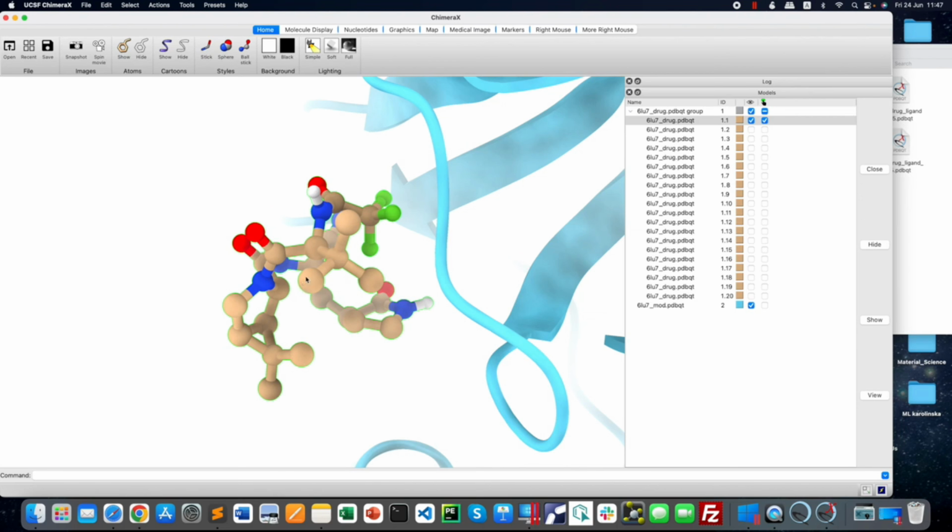And one more thing you have noticed, that when you select, it will be in a green colored selection. If you don't want this green colored selection in your publication, just go here, select, and clear. Okay, it will not be selected anymore. Or otherwise click here and untick the selected version.